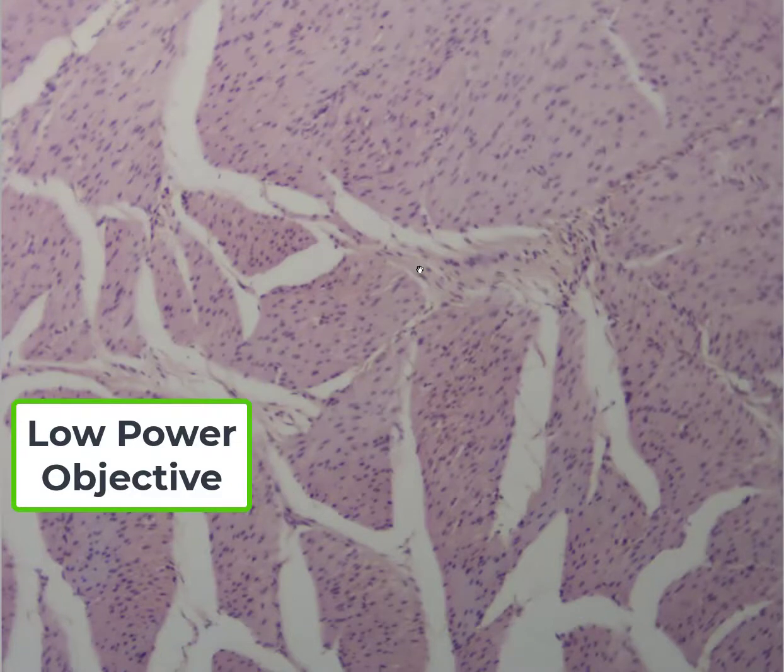So depending on which part of this smooth muscle we zoom into, we can see it in longitudinal section. We might see it in transverse section where the cells are coming out of the plane towards you. So I'm going to try and look at it in longitudinal section here. The first thing I'm going to do is switch my microscope to the low power objective here. I'm going to refocus, of course. Takes a little longer with these microscopes, but that's okay. And here we can see some very nice examples of some smooth muscle.